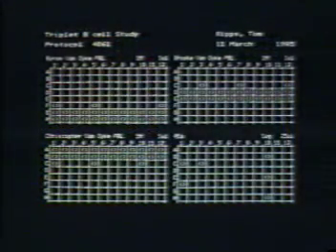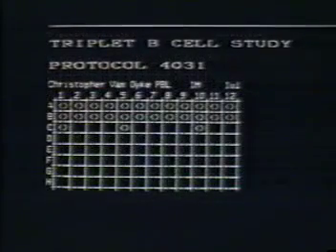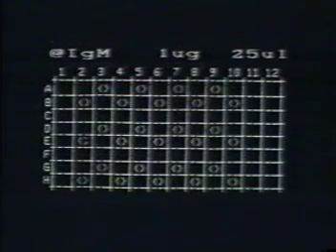Tom need only enter his description of each cell type and reagent once. The secretary takes care of duplicating the list onto each of his row cards. To complete his protocol, Tom indicates which reagents and cells he will pipette into each sample by placing marks in the appropriate sample columns on each row card. When he has marked each sample, he'll request a printout of his protocol, which will guide him as he stains the samples. A printed FACS desk protocol provides a set of sample grids, one for each cell type and reagent in the experiment. The grids are marked to indicate the wells or tubes into which the items should be pipetted.